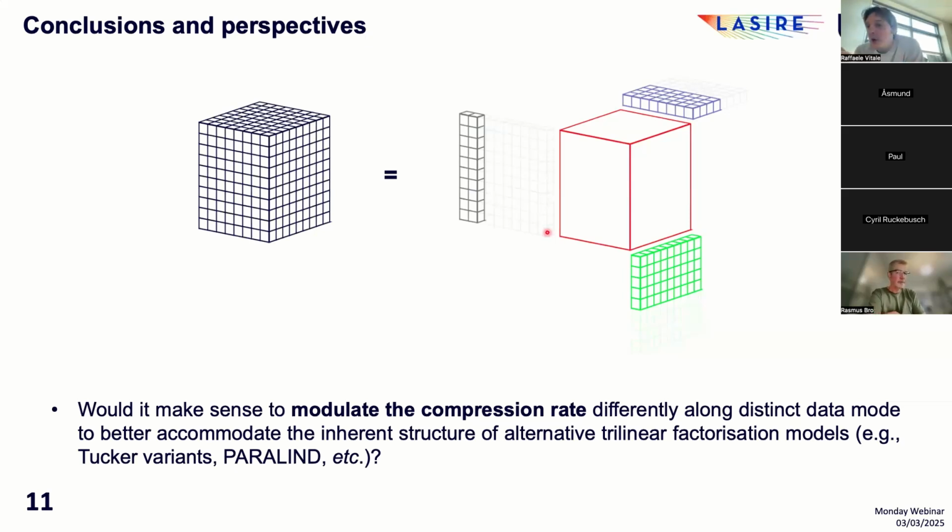Of course, I always say that this problem is important, but it's not that important, because you can always stay a little bit more conservative and say, okay, I overestimate my rank. The price to pay is simply I will not reduce the data as much as in the ideal case, but in that case you will be sure that all components contain information related to all your chemical components of your system.